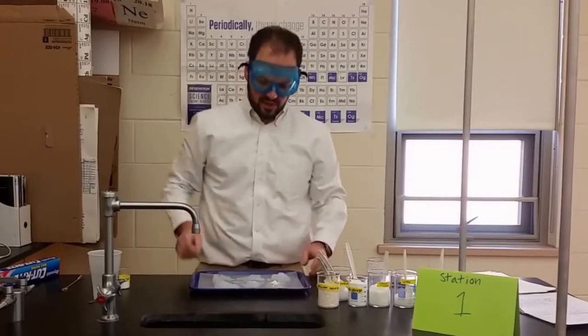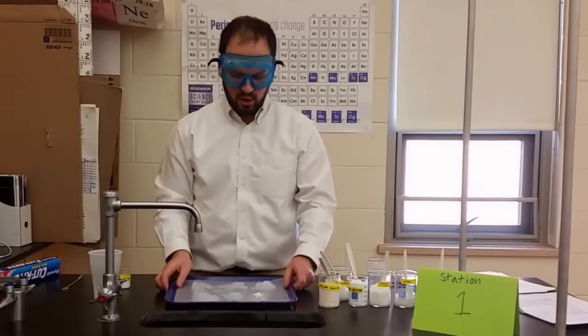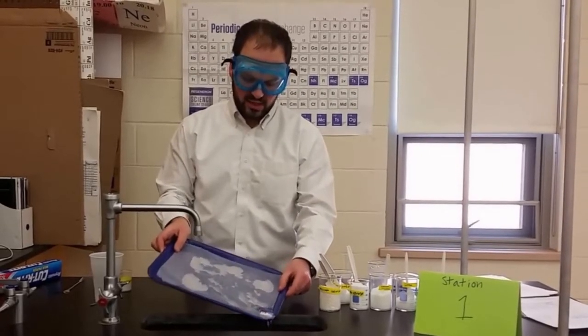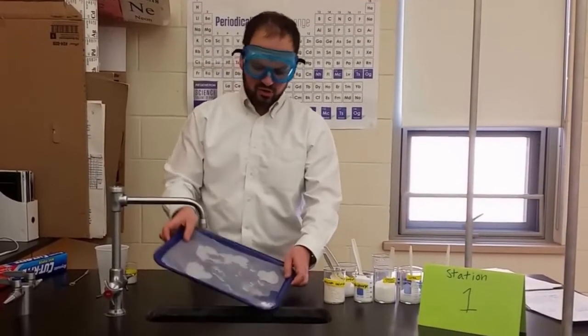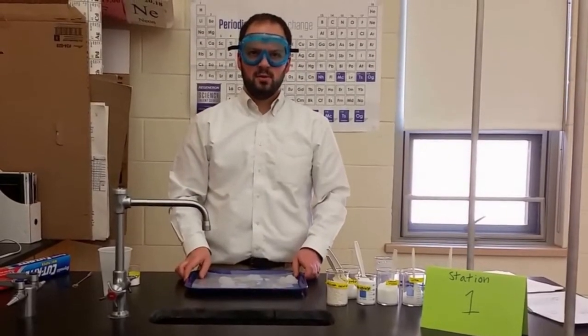At the end of this lab station, if there's excess liquid on your tray, you're going to go and tilt the tray and let that excess liquid flow into the sink. Do not let gel or wax paper get into the sink because that could clog the drain. Any extra solids at the end of this lab are going to go into the trash.